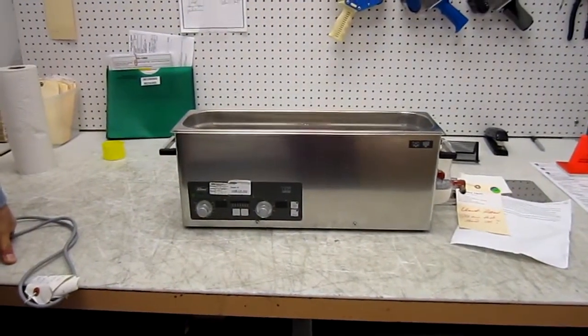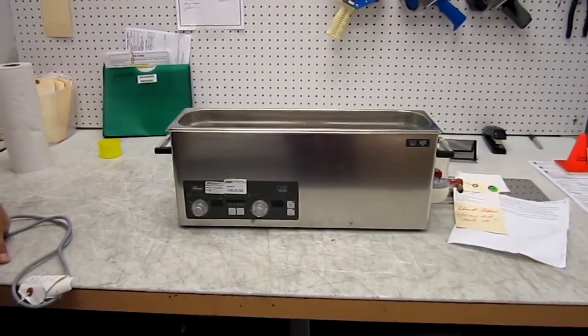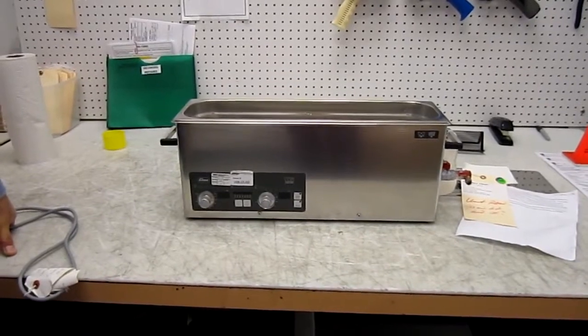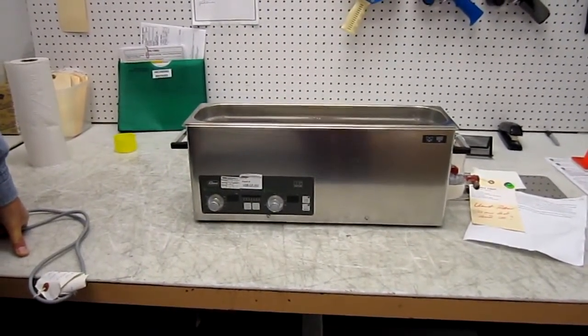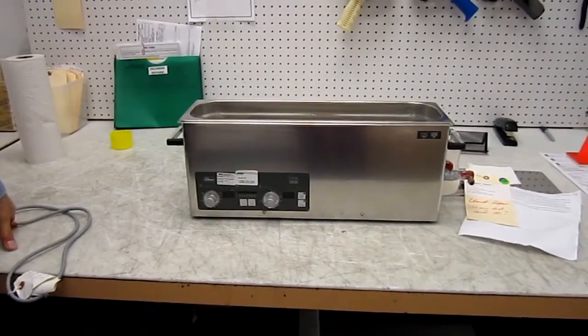I'm Doug Wagner from Rochester Industrial. I want to give you a few pointers on how to operate your ultrasonic cleaner. First of all, remember never run the ultrasonics without water in the tank — it might damage the PZT crystals.